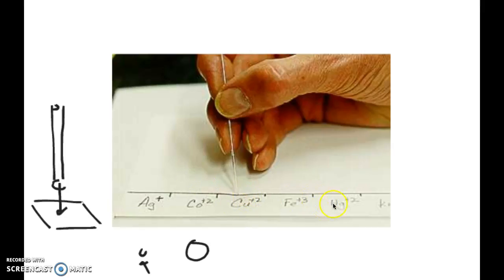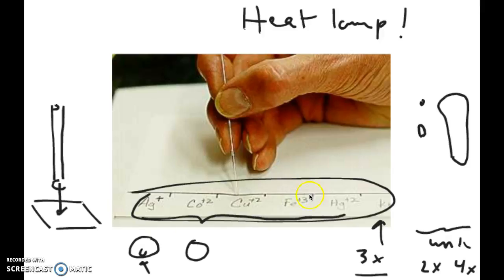Now there are some of these samples that need to be spotted a couple of times. If you're going to have to spot the sample a couple of times, in this case the known sample has to be spotted three times. Make sure you spot it and then dry it first. You can dry it either just by sort of waving the paper around, air dry it, or you can take it to a heat lamp.